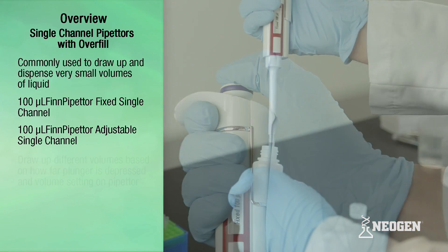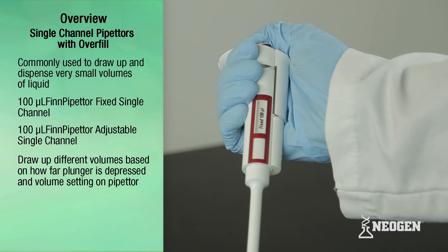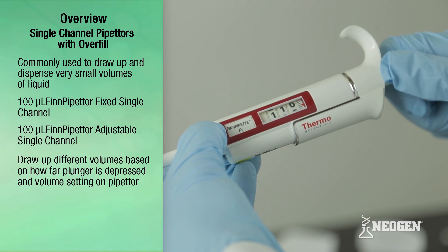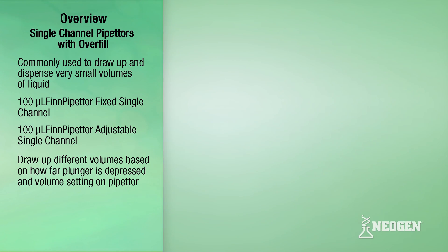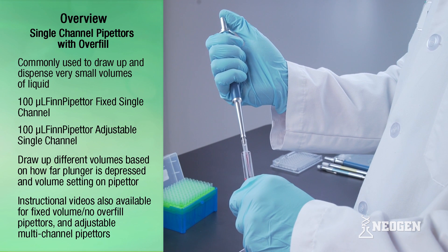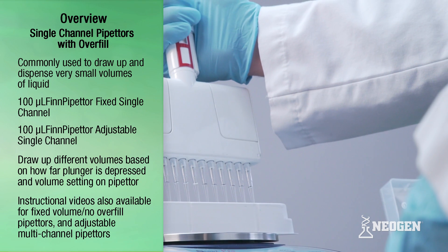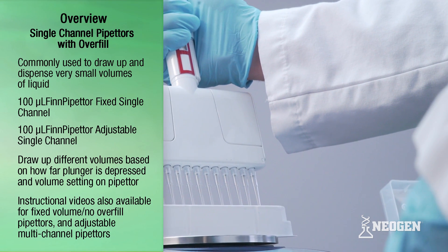These pipetters can draw up different volumes depending on how far the plunger is depressed and the volume setting on adjustable pipetters. Neogen also has instructional videos for pipetters that draw up a fixed volume with no overfill level and multi-channel pipetters that can draw up multiple channels at a time.